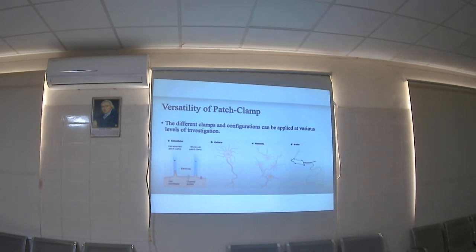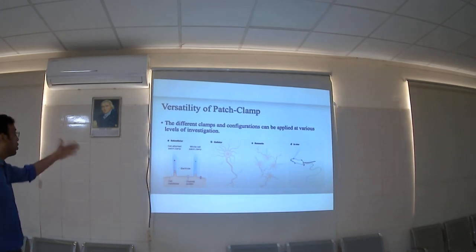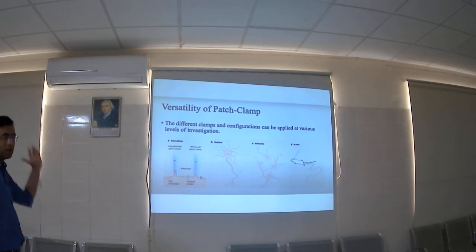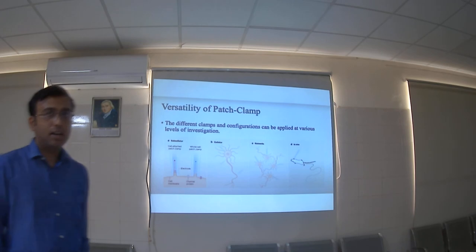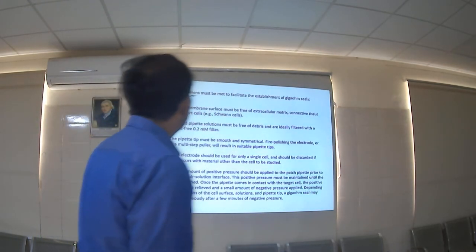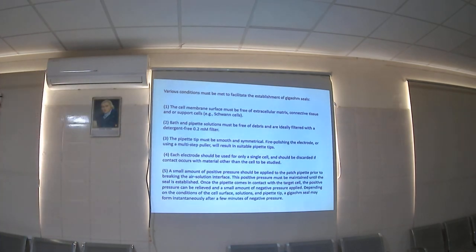So the cell-attached patch clamp can be on the cell membrane, whole-cell patch clamp can be inside the cells, or a single ion channel can be studied. Various conditions must be met to facilitate the establishment. There are various conditions that you have to keep in mind for a very optimum physiological recording.